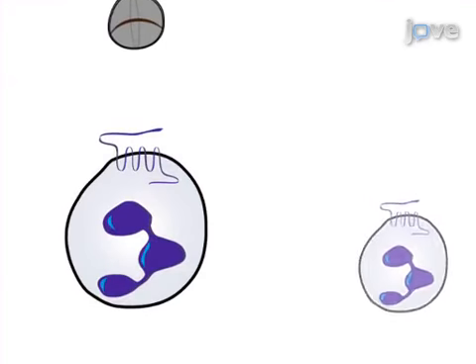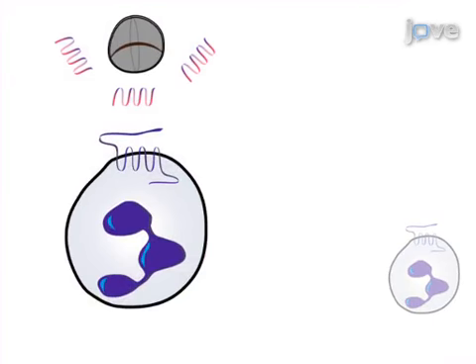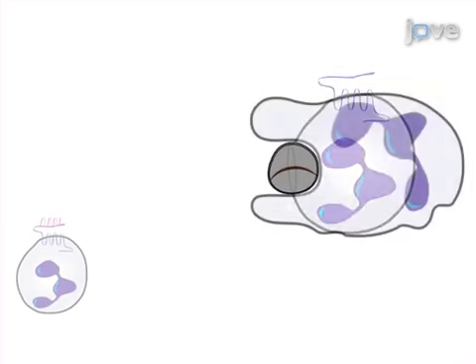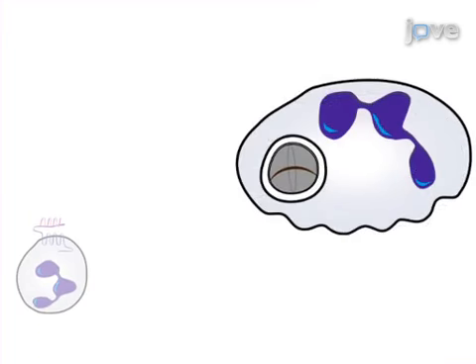Next, the neutrophils are either loaded with fluorescent dye and mixed with a concentration series of PSMs with and without inhibitors, or they're allowed to phagocytose S. aureus bacteria containing a PSM alpha promoter GFP reporter construct.